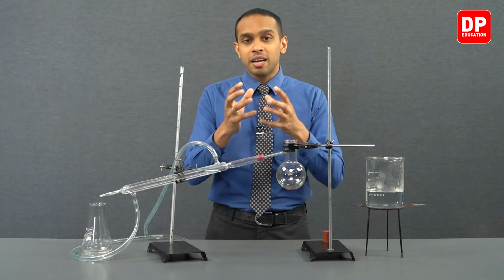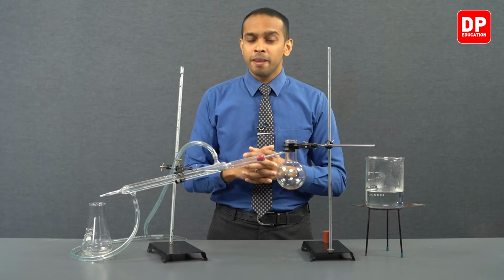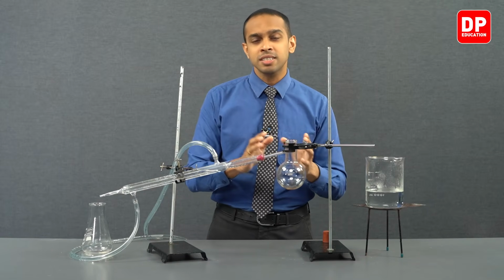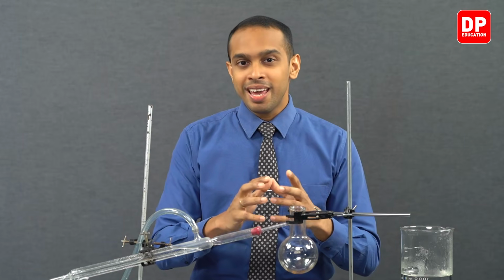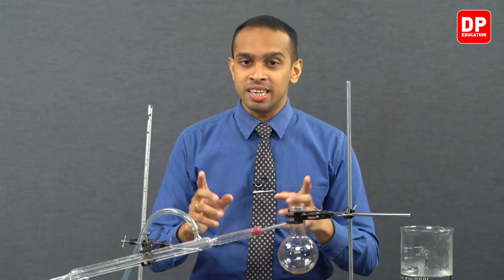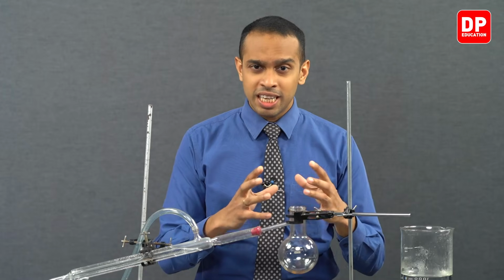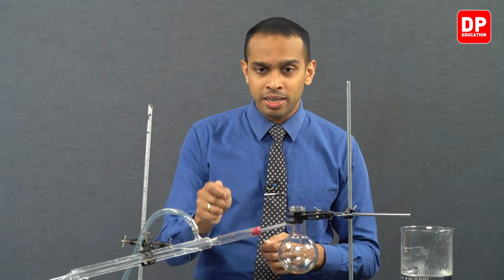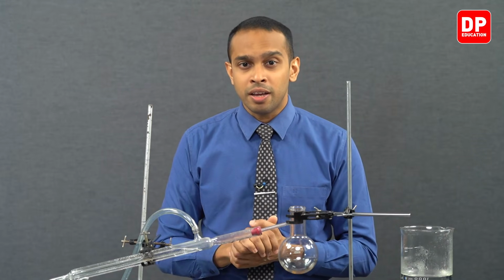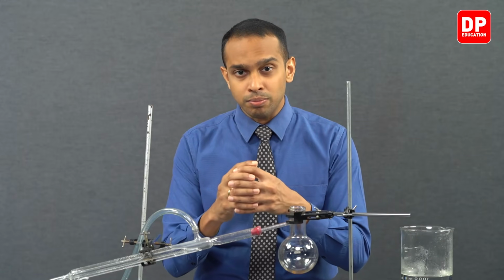Afterwards, we extracted the diethyl ether layer through the separating funnel, and we added anhydrous sodium sulfate to remove any traces of water that was found in the diethyl ether layer. And if there were any water in the diethyl ether layer, when you add anhydrous sodium sulfate and keep swirling the mixture around, you would see the formation of sodium sulfate clumps.